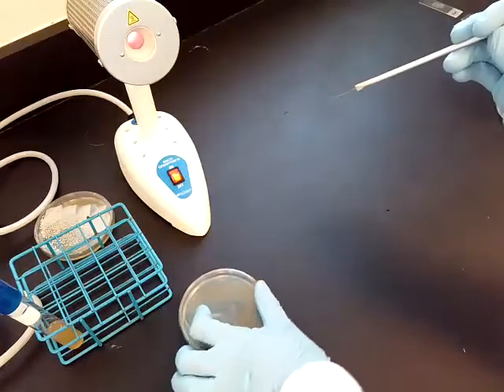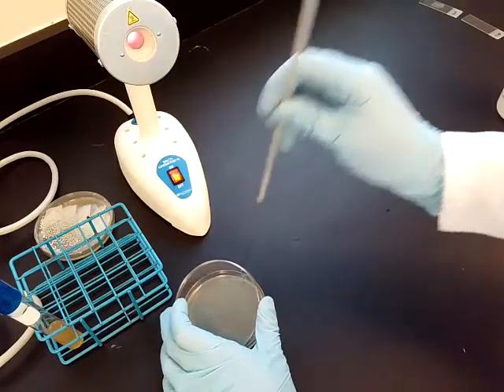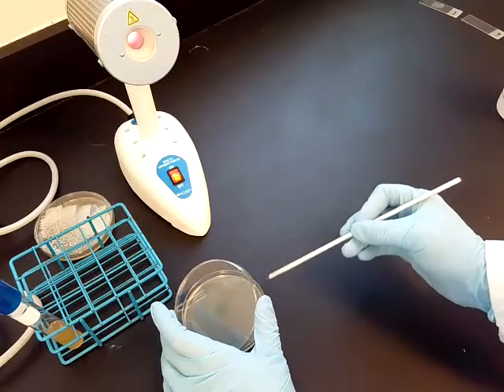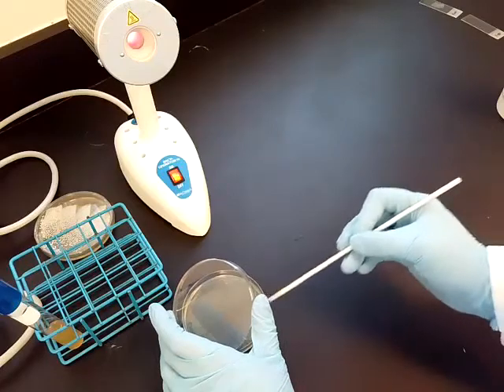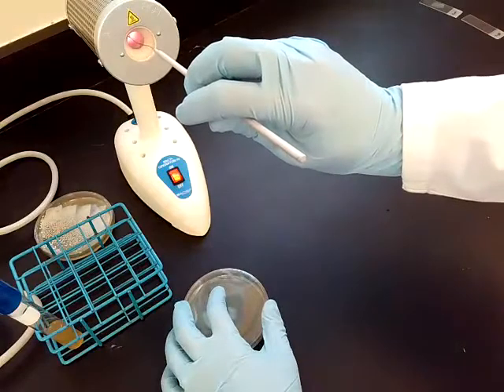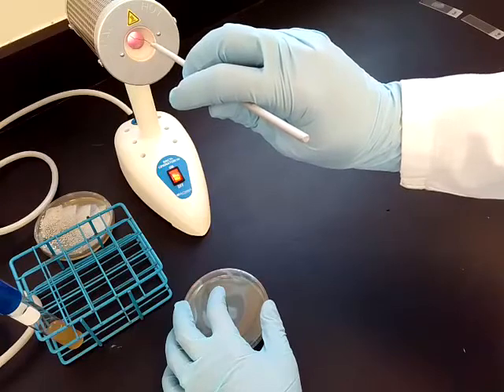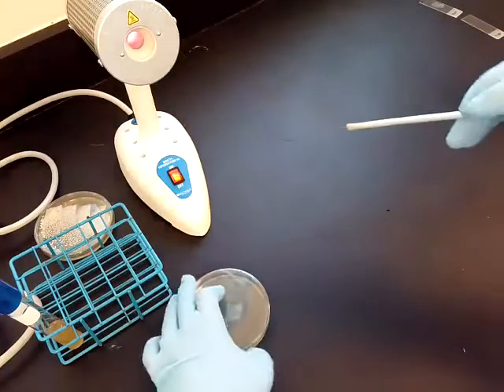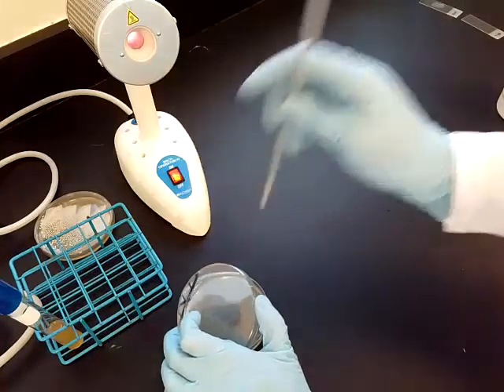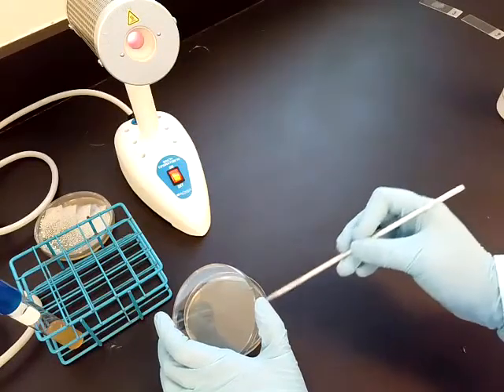I'm going to rotate the plate another 90 degrees, and then I'm going to stab the loop into the side of the agar so that it cools off the loop, and I'm going to spread it from the second quadrant into the third quadrant. And again, I'm going to take it 3 times. I'm going to flame sterilize the loop. And then I'm going to rotate the plate 90 degrees. I'm going to stab this into the side of the agar, and then I'm going to rub it from the third quadrant into the fourth quadrant.